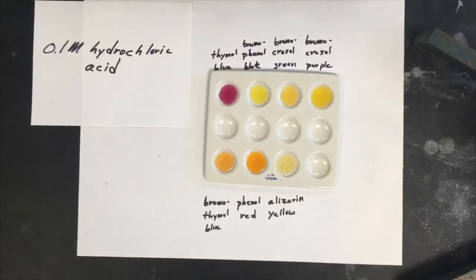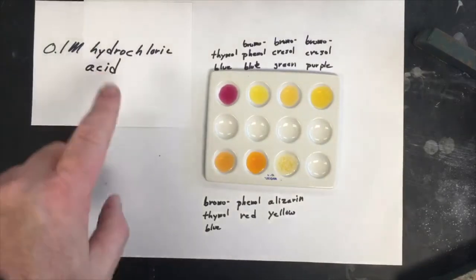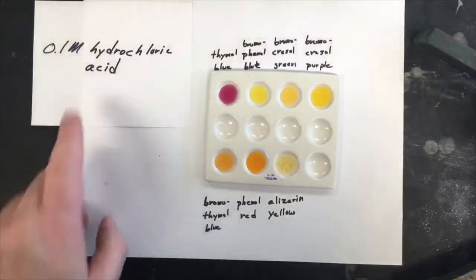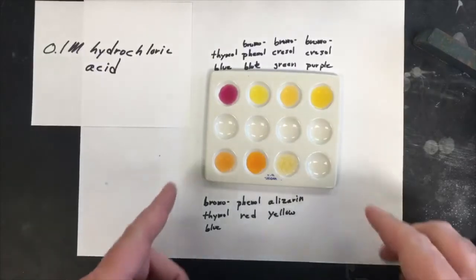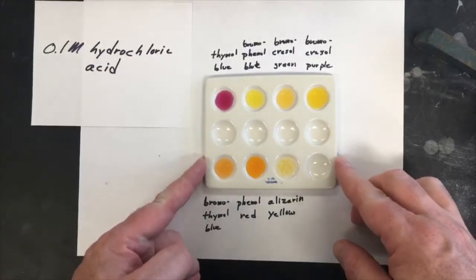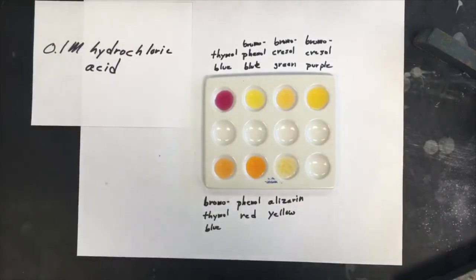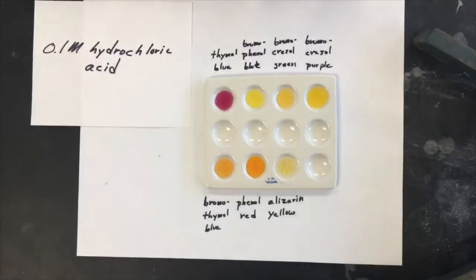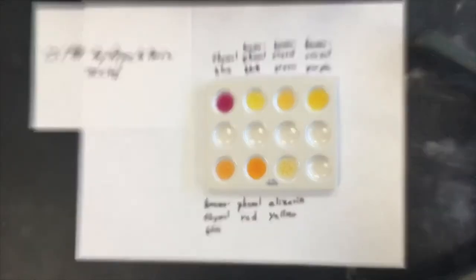Alright, now we have the third sample. This is 0.1 molar hydrochloric acid. And again we have the dyes in their same positions. And about three drops of hydrochloric acid with one or two drops each dye. Let me zoom in a little.